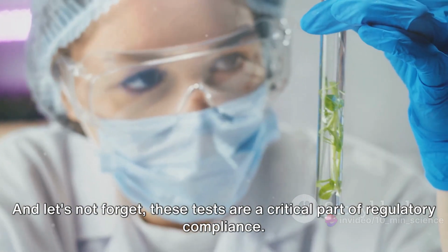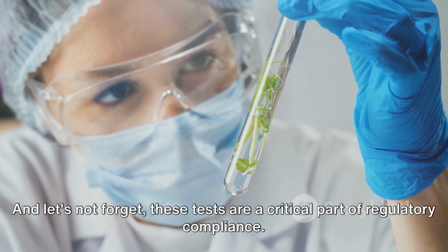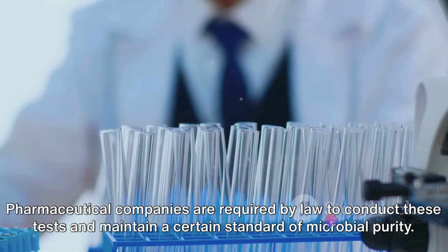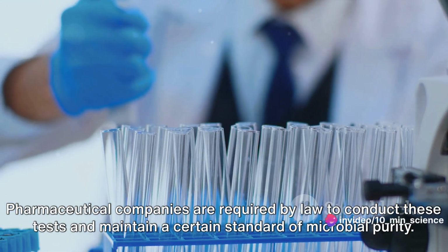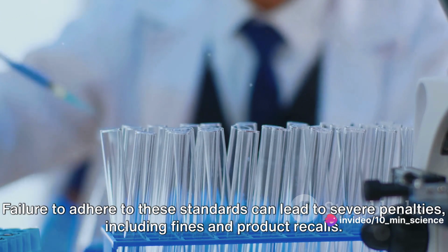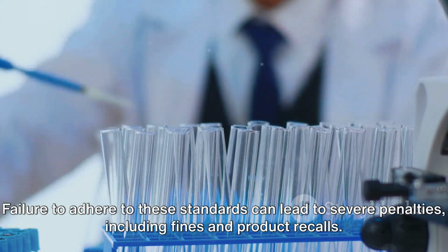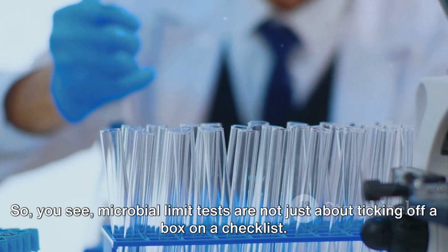And let's not forget, these tests are a critical part of regulatory compliance. Pharmaceutical companies are required by law to conduct these tests and maintain a certain standard of microbial purity. Failure to adhere to these standards can lead to severe penalties, including fines and product recalls.